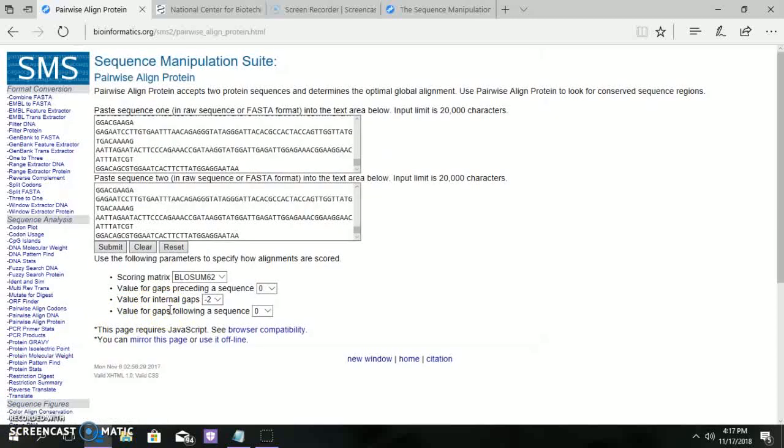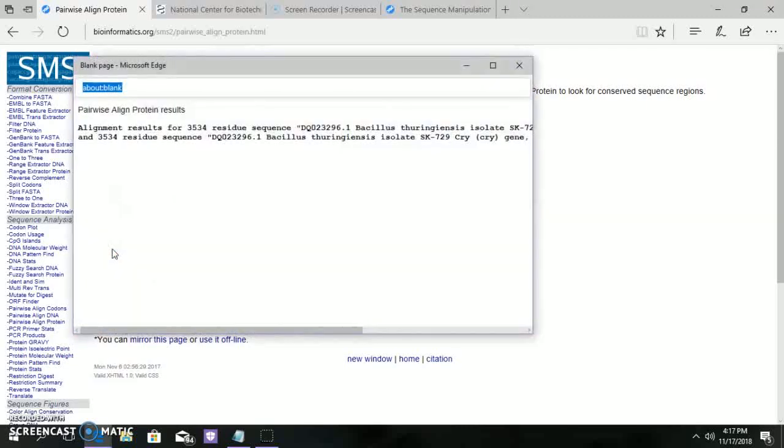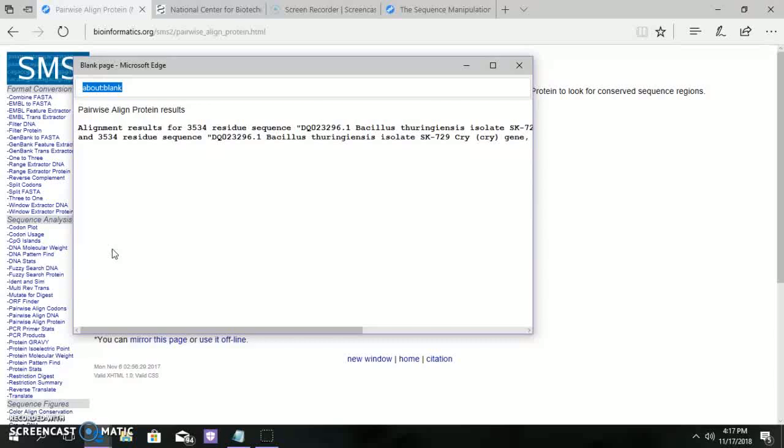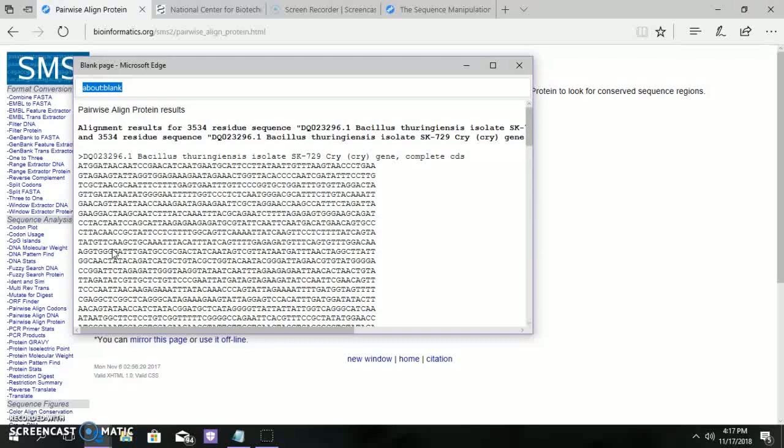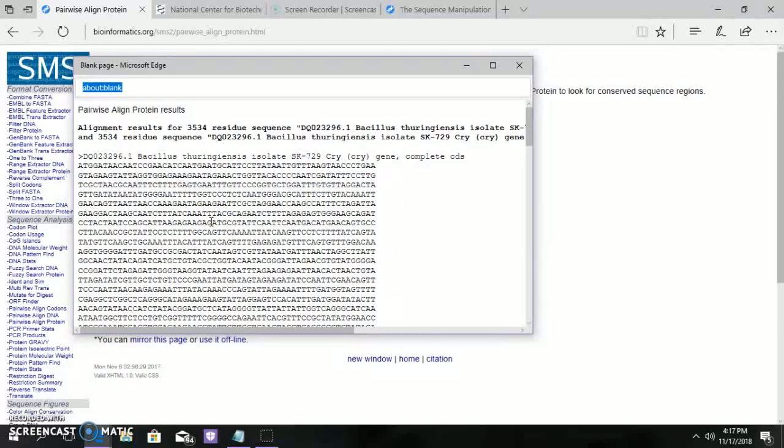Next, about the protein pairwise alignment. Submit two sequences in the box. The protein pairwise alignment tells about the similar or identical sequences which occur in proteins across species or within the genome. Here for Cry gene, the alignment score is obtained as 3534 residues.